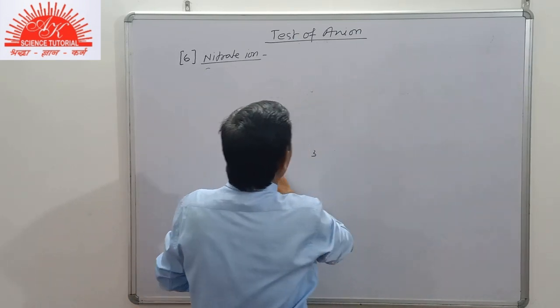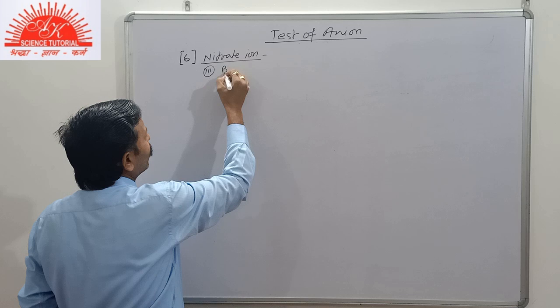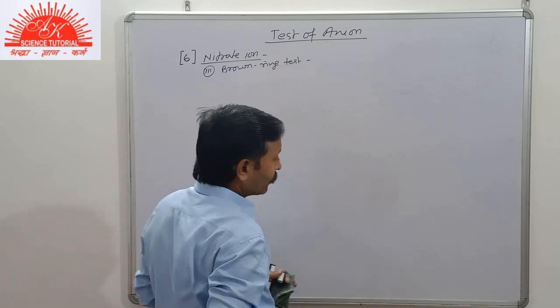Now students, the third and one of the important tests for nitrate ion is also known as the brown ring test.